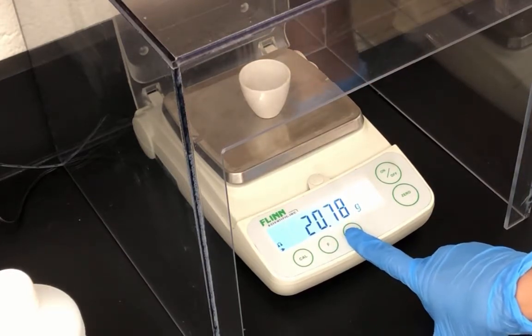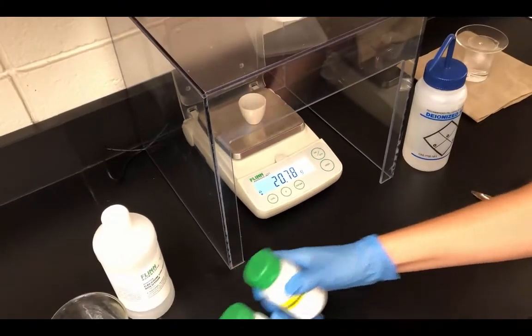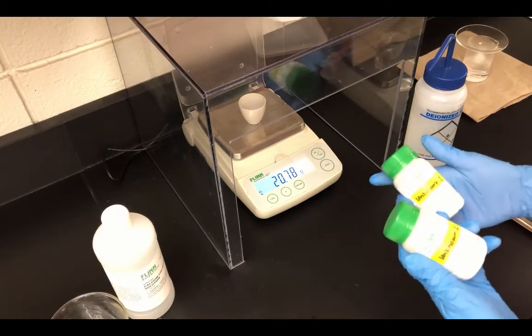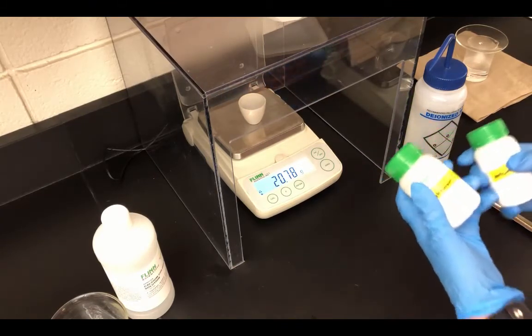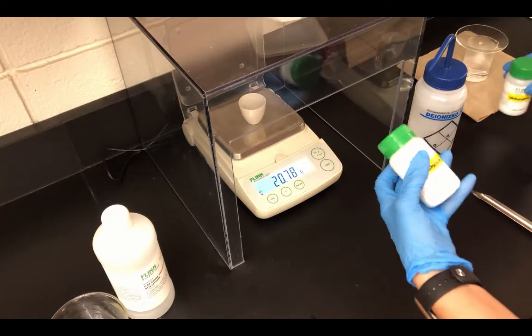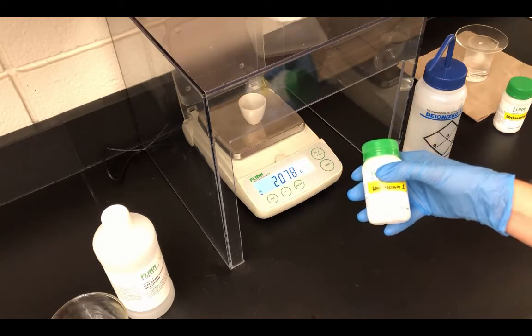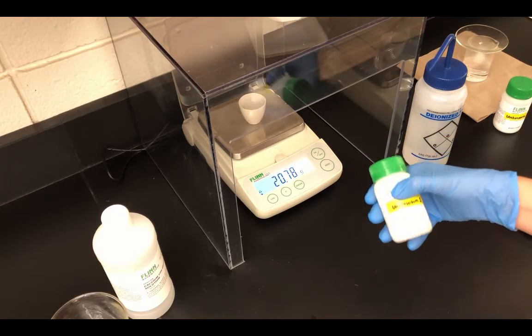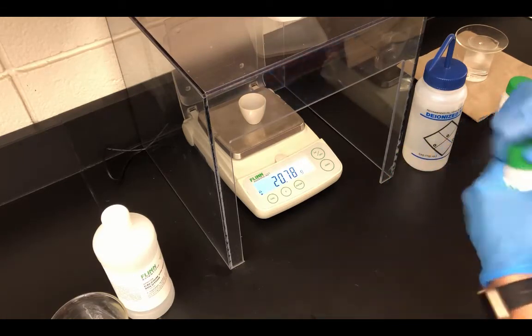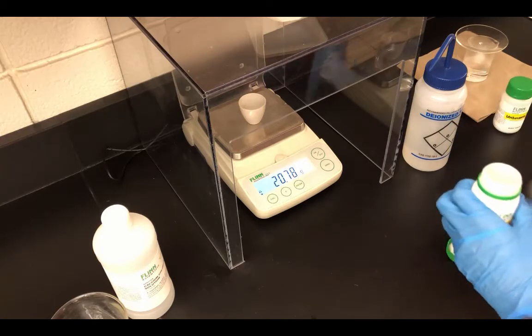So make sure that you record that. Now we're going to take one of the unknowns and we're going to add 2 grams to the crucible. Whichever unknown you pick is up to you. We will go ahead and use unknown 1. I will give you the data for unknown 2 as well, so if you want to do the other unknown, that's fine. For unknown 1, make sure that you record that we're using unknown 1.